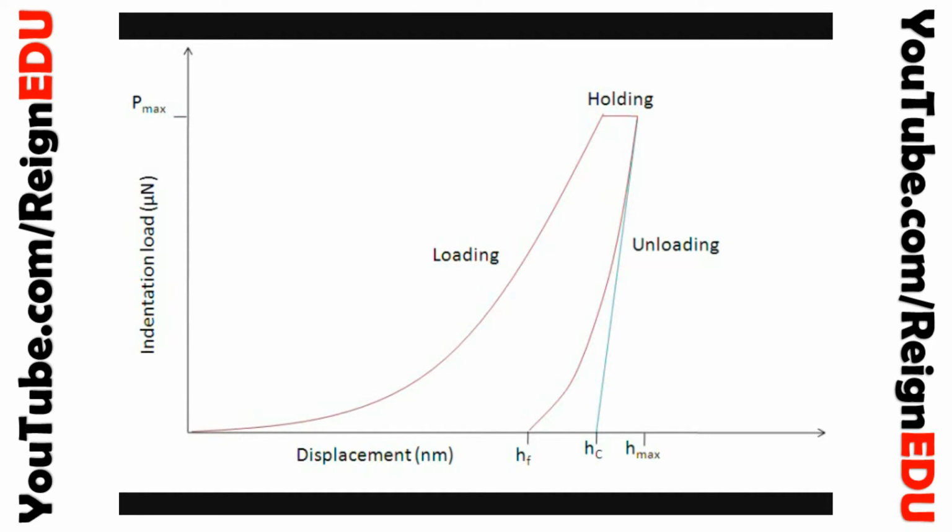The characteristic load versus displacement curve is shown here. The load used in this technique is in the range of 1 micronewton to several newtons. Depth varies between several tens of nanometers and several micrometers. During the loading phase, load increases with time. After attaining the maximum load, holding is done, then unloading is done, and we can measure the elastic modulus, the reduced modulus, by drawing a tangent from the initial portion of the unloading curve.